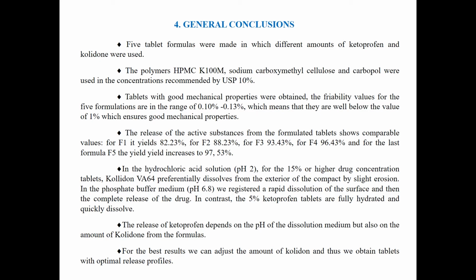In contrast, the 5% ketoprofen tablets are fully hydrated and quickly dissolve. So, the release of ketoprofen depends on the pH of the dissolution medium, but also on the amount of kollidon in each formula. For the best results, we can adjust the amount of kollidon, and thus we obtain tablets with optimal release profiles.